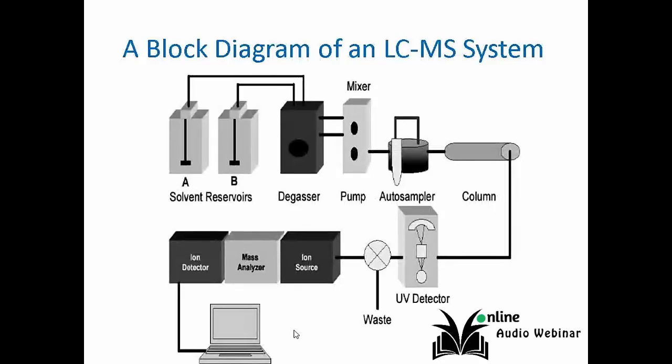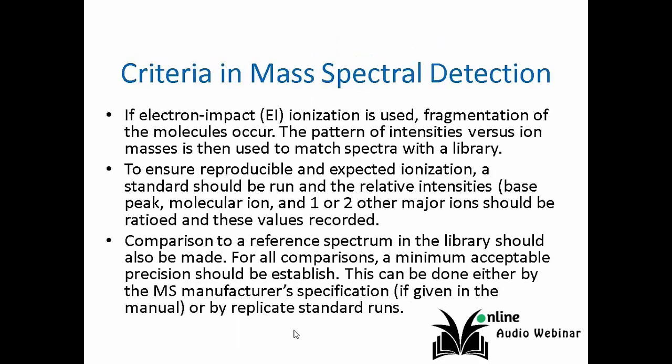Or the mass spec. I'll go on briefly. There are many things that go on with mass spectrometers that can be issues, and that may cause some problems as far as the splitting ratio, or lead to a surface material that may actually affect the composition. One big caveat that comes into play with mass spectral detection that is very commonly used is electron impact. Electron impact is used because you're breaking the molecule up with energy. It's typically using highly charged plates.